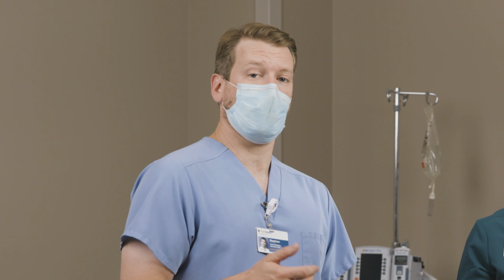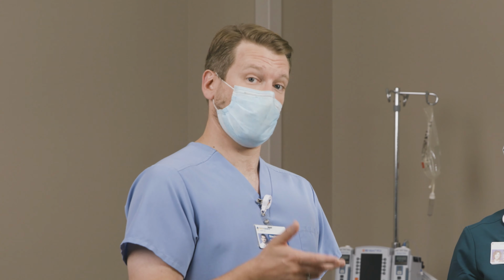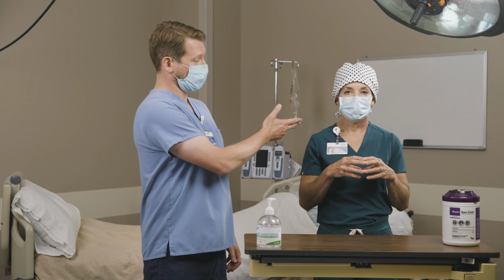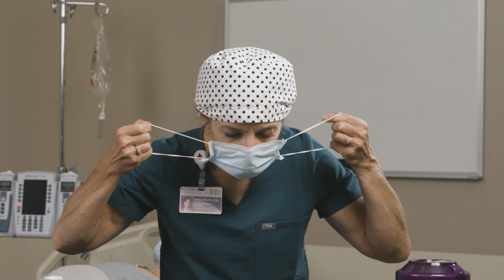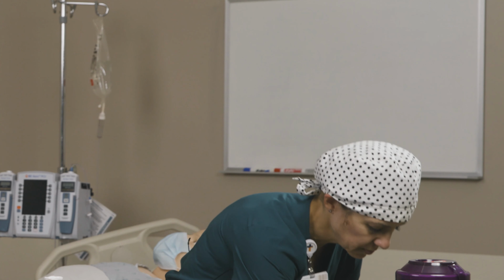We demonstrated the donning and doffing process for special droplet contact precautions with an N95 mask, but with a droplet mask, we would do the same process. But when doffing the droplet mask, Krista wants to make sure to reach back and only touch the ear loops, leaning forward so that the mask is not coming into contact.